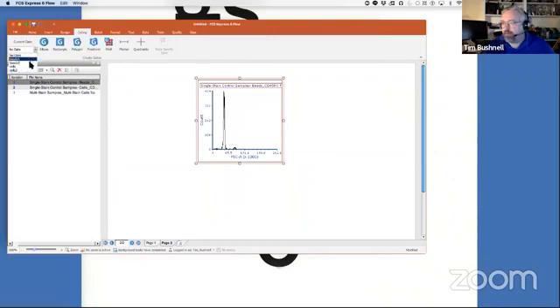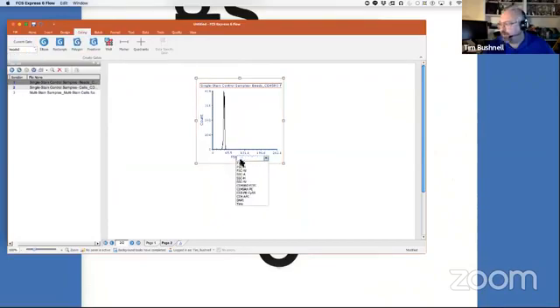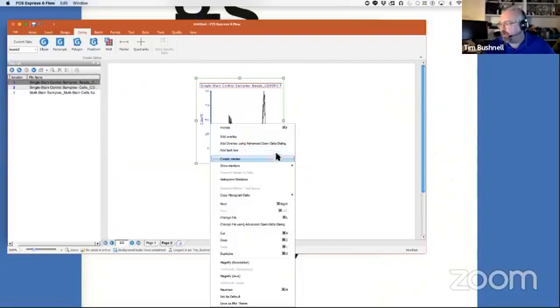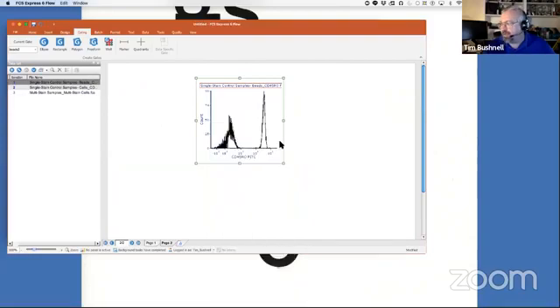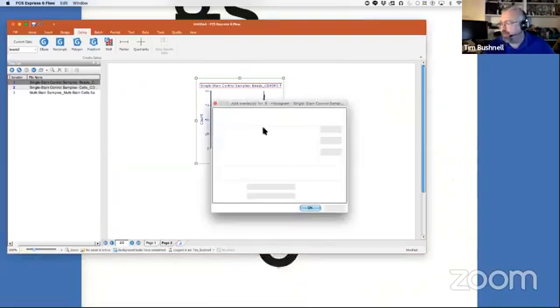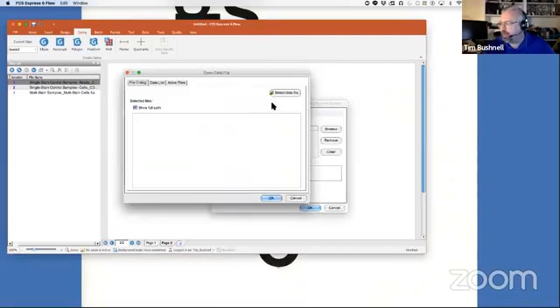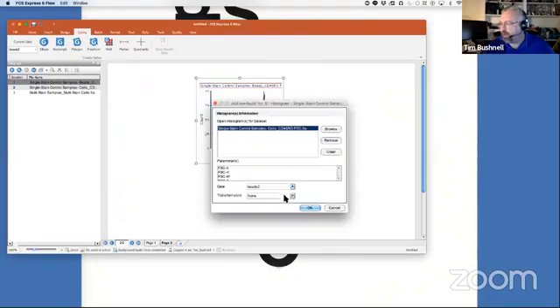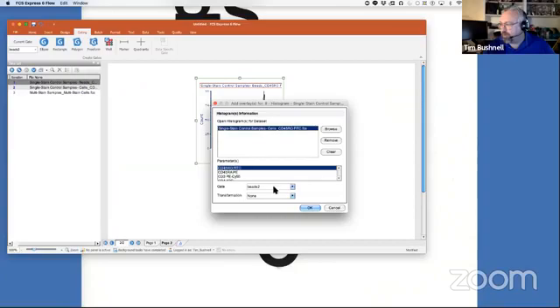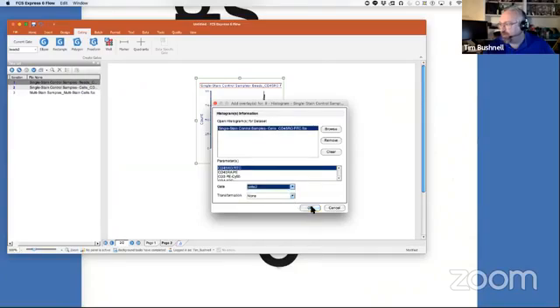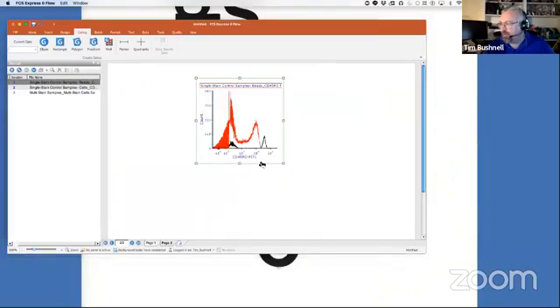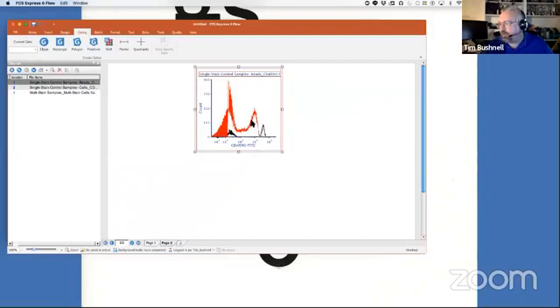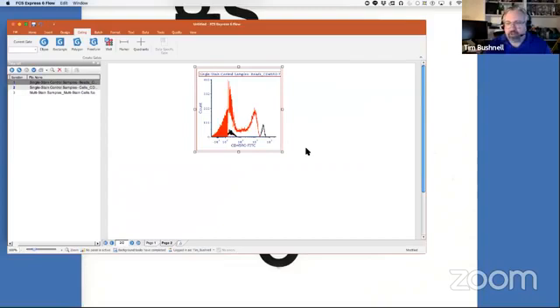We're going to gate on this. This is our beads. Put this to our FITC. And now what we're going to do is we're going to do it in an overlay. And I'm going to take the data list here. We're going to overlay this with our fluorescein and we're going to use our cells. So here you can see our beads are definitely brighter than our single-stained cells. So we are going to follow the first rule of compensation that we have a signal that's at least as bright as it's going to be on our experimental samples.